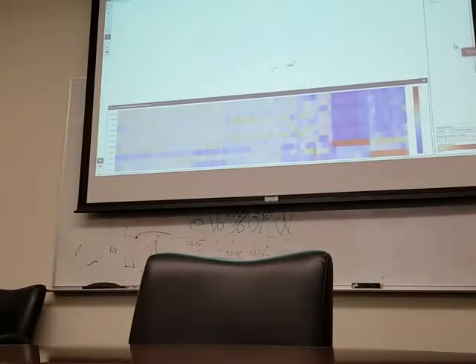That should be most of them. They're in the middle. Those are the ones we want. Oh, I see the dot. It takes a while to refresh. So why is there a concentration in the upper left, but not so much in the middle? Well, that's CD19, all the B cells. The cells I'm interested in have higher levels of CD19. So it's not just on or off. There's some subset or some patient with elevated CD19, but only in some subset of their cells.